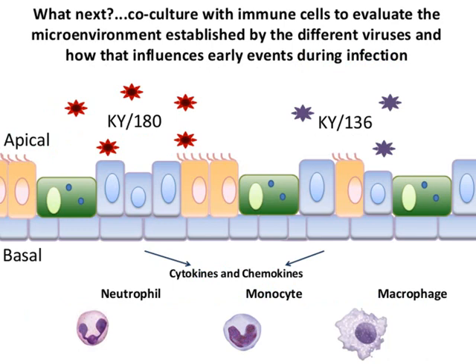I will end my presentation with our laboratory's working model of influenza infection with viruses of the same strain. Our next objective is to see how the viruses alter or interact with recruited immune cells, and then further look at interactions between EpiAirway tissues and those recruited cells.